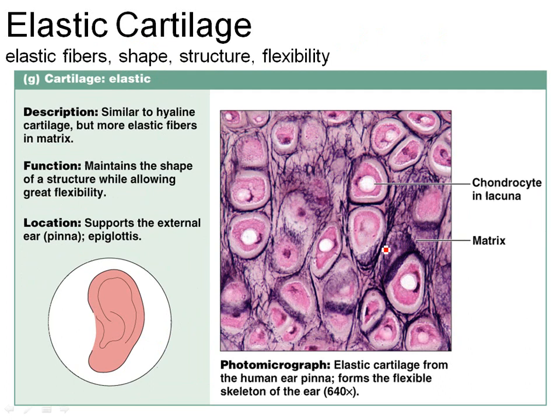Elastic cartilage is a cartilage. It still has lacuna. It's still got fibers in the matrix. All the same rules apply. The only difference is you have a lot more elastic tissue. These dark lines, that's elastic fiber. So that means we now have a cartilage that's very flexible. That's the external ear, your pinna, and also your epiglottis.